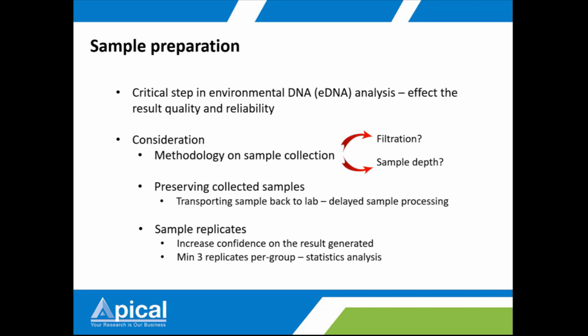Or the best is you can filter the water, right? You filter out the water, then you can keep the filter paper in cold storage and then transfer the sample back to the lab. Okay, this is if you have a problem transporting the samples to the lab, so this is a delayed process sample. So you have to consider how to preserve the sample once you collect it from the environment.